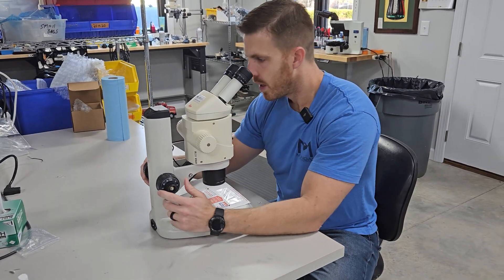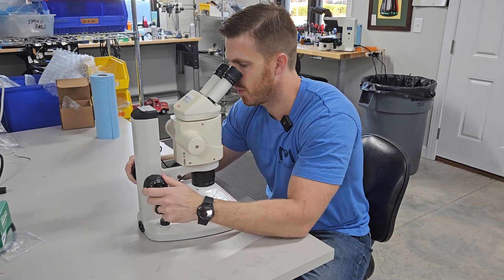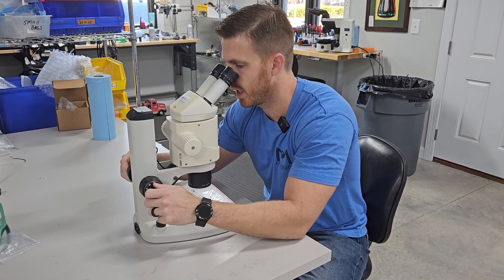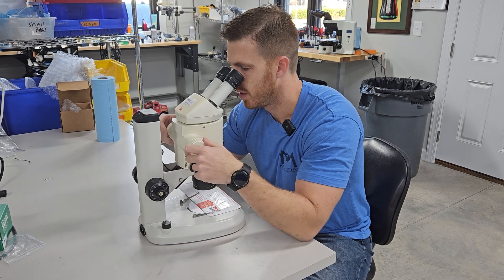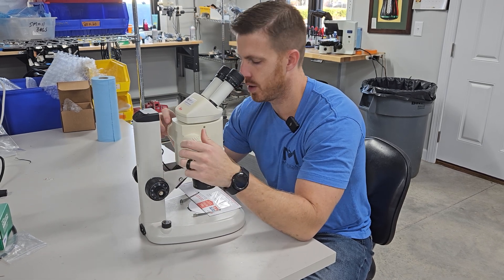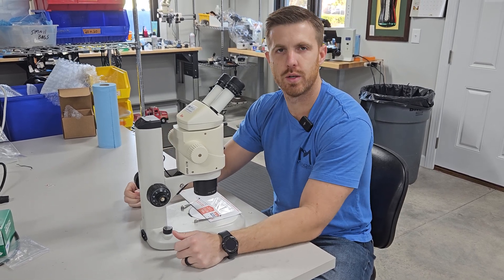What you do is zoom the microscope in and then refocus at the highest magnification point. Once you get it in focus there, zoom it out and it should hold focus throughout the whole zoom travel.